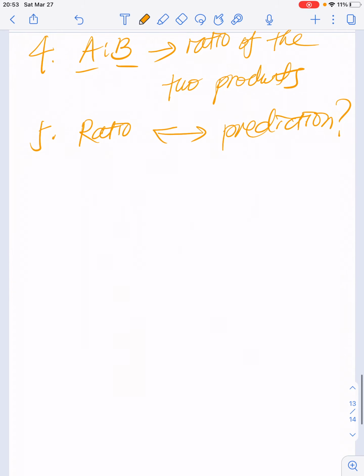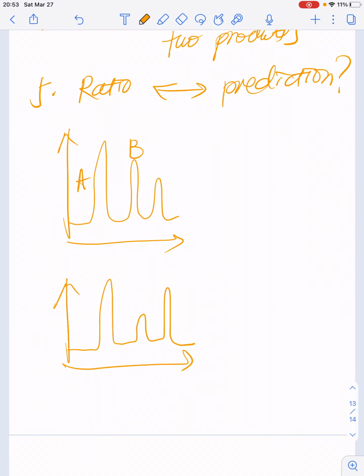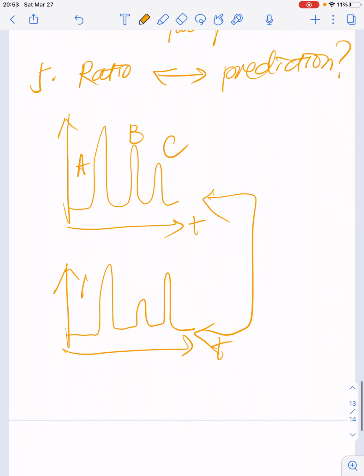There are some occasions you will run into spectra like here: 1, 2, 3. So there are 3 peaks in both spectra, right? They have the same mixture, just different ratios. Retention time. That's a solvent. If you only judge by the ratio differentiation, you know that you're producing more of B.